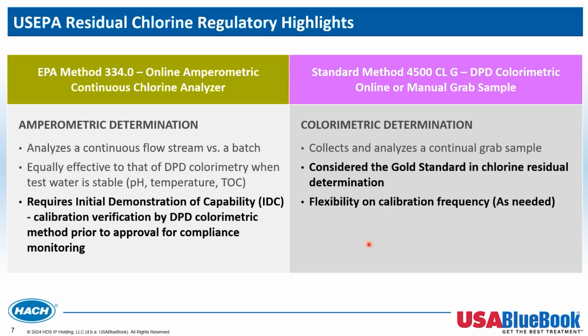However, it locks the customers, the end users of the equipment, into one particular type of instrumentation, the colorimetric instrumentation.